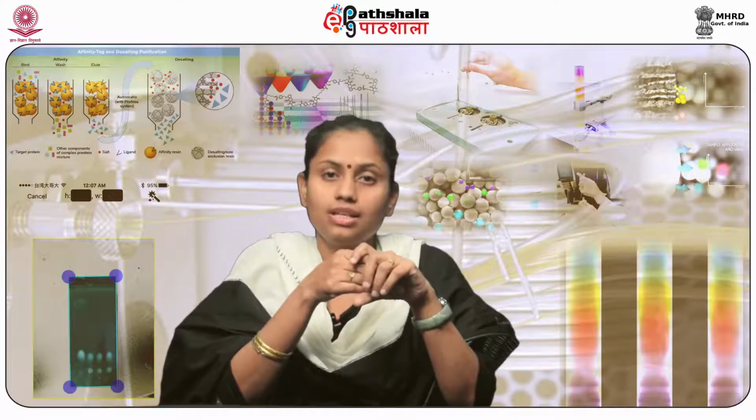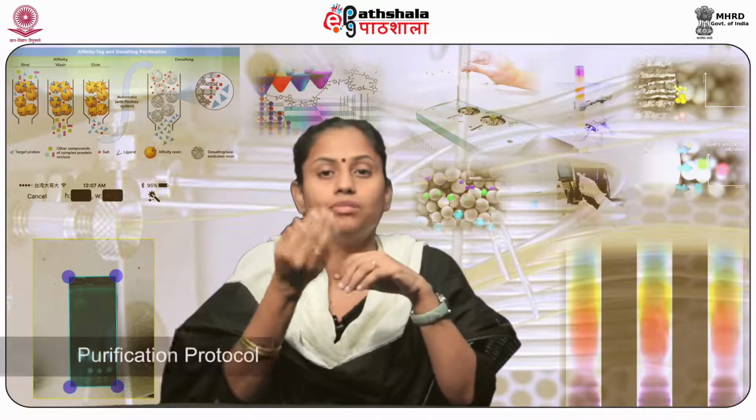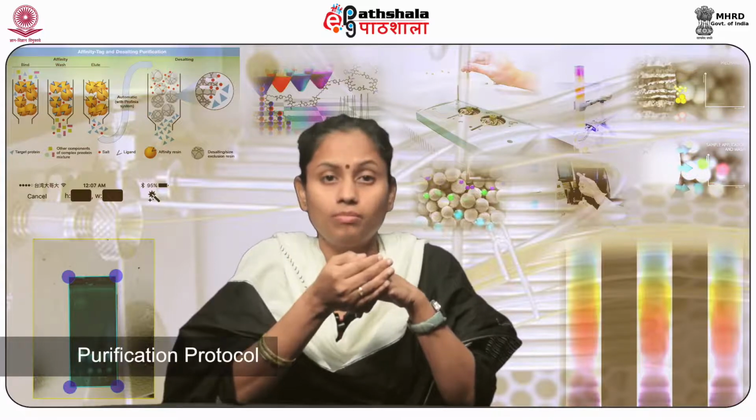Now, on the basis of the type of resins that are used, ion exchange chromatography is classified either as cationic or anionic exchange chromatography.